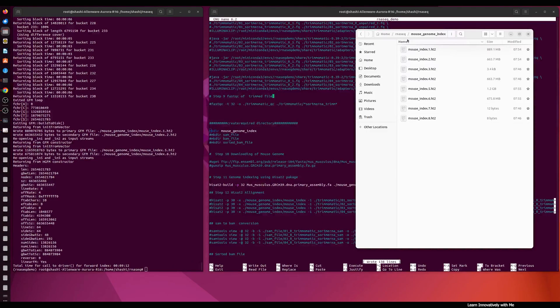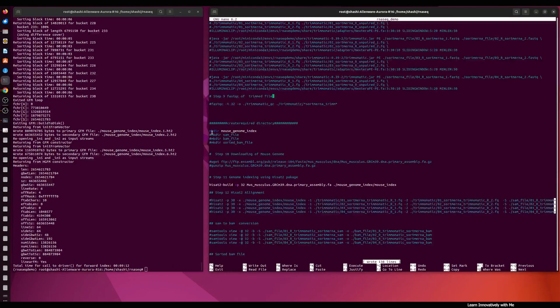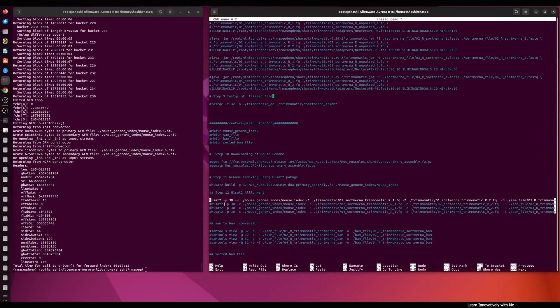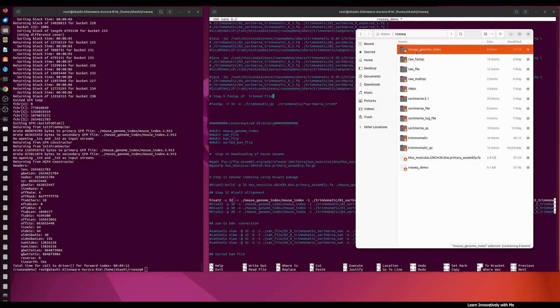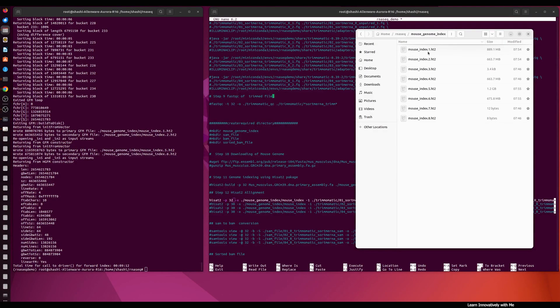Indexing is complete for the reference genome. I'm going to comment out the genome indexing command and the mkdir command in the script. The next step is alignment. I'm going to activate the alignment command in the script: hisat2 -p 32 — that is the thread value. Here you can see mouse_genome_index as the input index. In the RNAseq directory we have mouse_genome_index and if you open the directory you can see the mouse genome index files 1 through 8 are present.